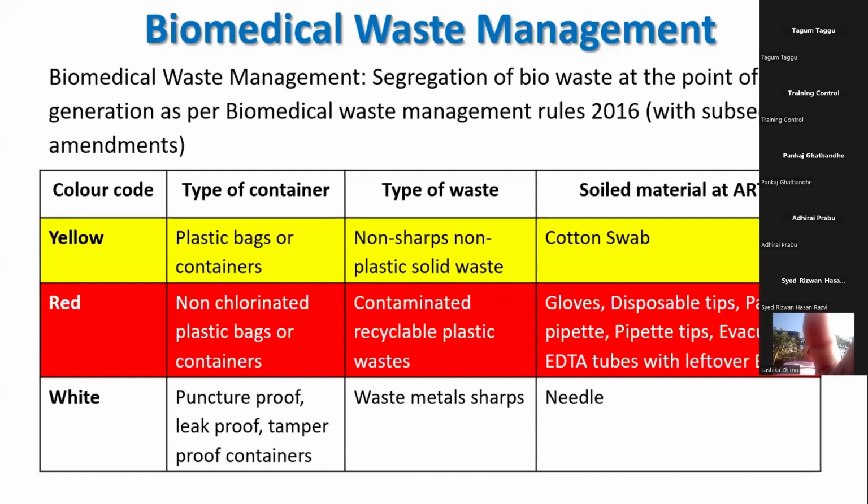And the white box, that is puncture proof box, is only for needles. Here, I would request one of the participants or anyone to please unmute themselves and answer this question. In the puncture proof container, is there a requirement of 1% hypochlorite solution? Is it required to pour 1 ml of 1% sodium hypochlorite every day, or can you directly discard the needles in the puncture proof container without hypochlorite? I request someone to respond to this question, please.